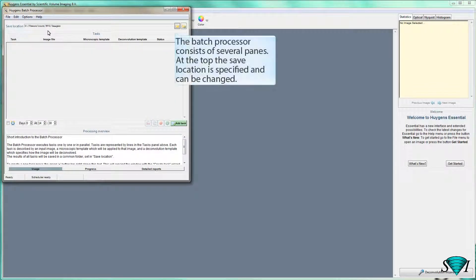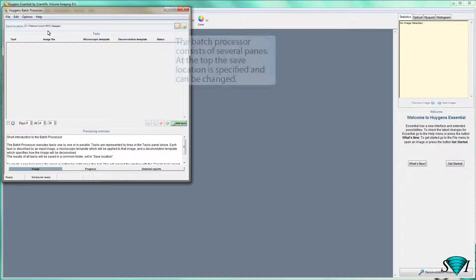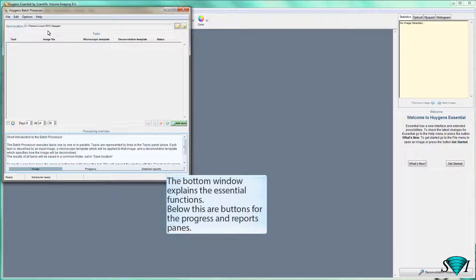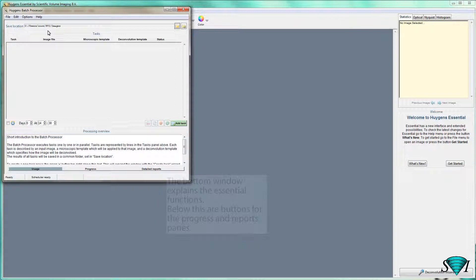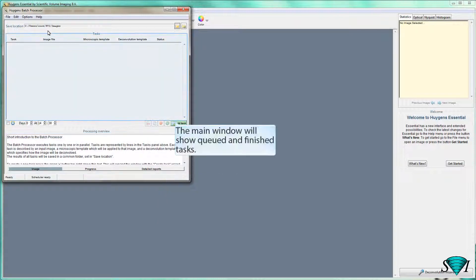The Batch Processor consists of several panes. At the top, the save location is specified and can be changed. The bottom window explains the essential functions. Below this are buttons for the progress and report panes. The main window will show queued and finished tasks.